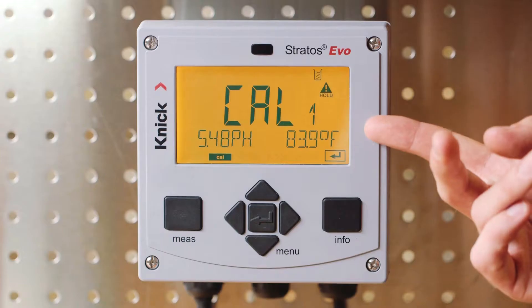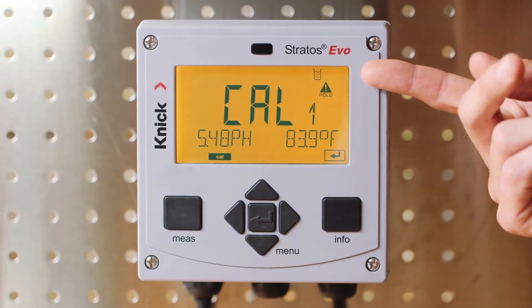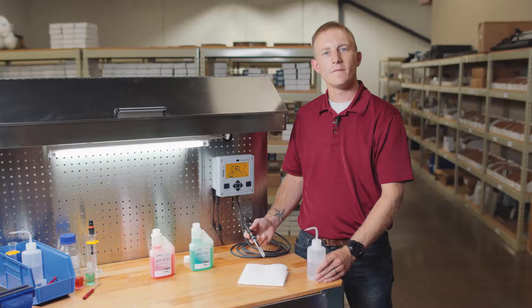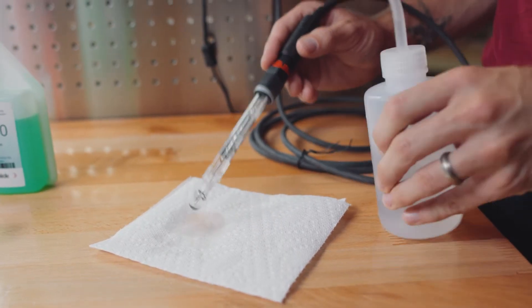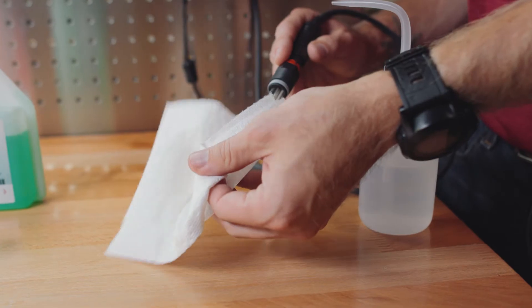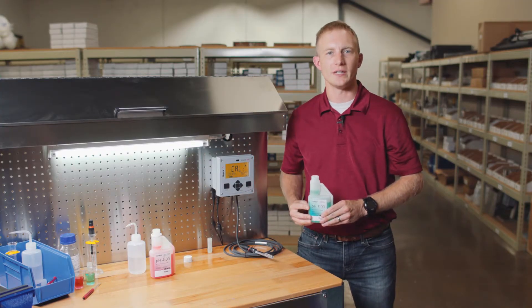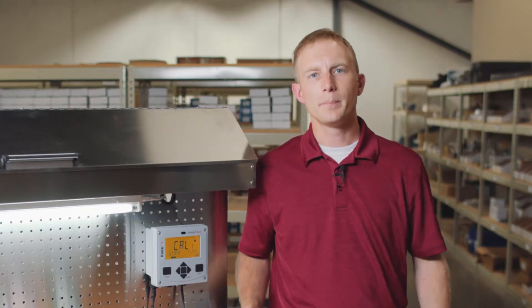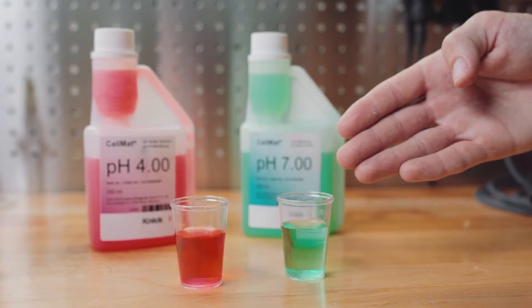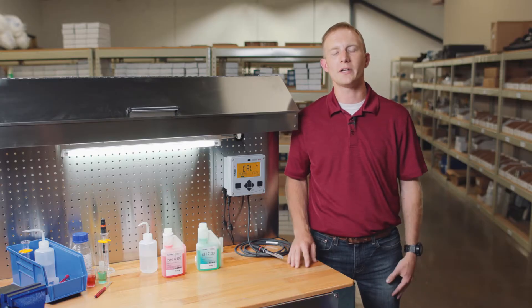Once the calibration process begins, you can see that our transmitter screen is turned yellow and the hold icon is indicating that our output to our control room is being held. First, we'll rinse our sensor with distilled water and dab dry with a clean cloth. I'm using Kinnick Calimat buffers with integrated dosing cup for single dose usage. If you're not using Kinnick Calimat buffers, be sure to put your buffers in separate clean containers to prevent cross-contamination and for a more accurate calibration.